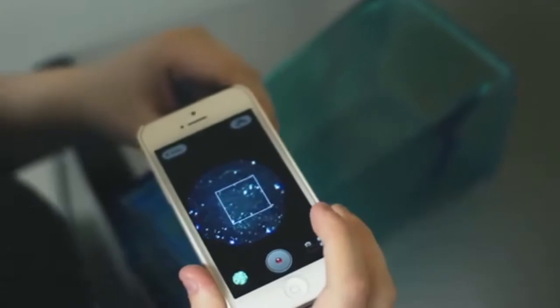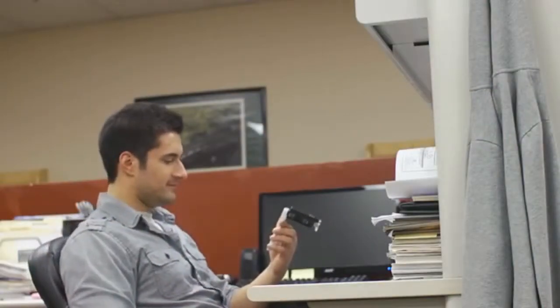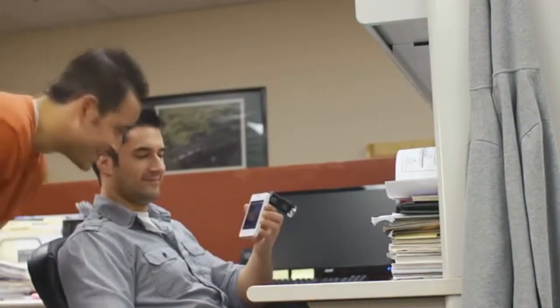When we designed this thing, it was our intention to manufacture a super powerful microscope that you can fit right into your pocket. We've had farmers call saying they were using it to inspect bugs, teachers calling saying they were using it to inspect lice, and we've even had people call saying they were using it as a party favor and having a blast. It has a wide variety of uses and the best part is you can hook it up right to your iPhone.